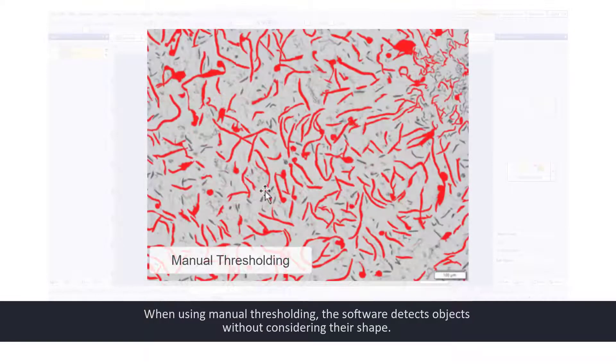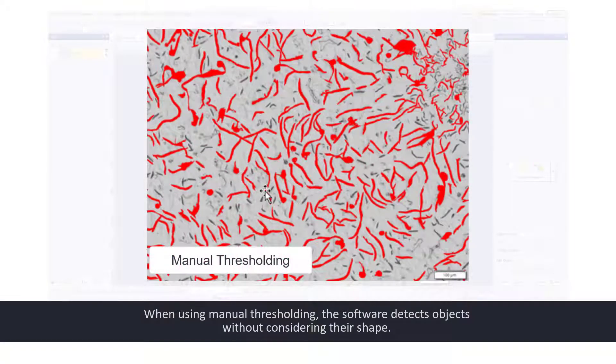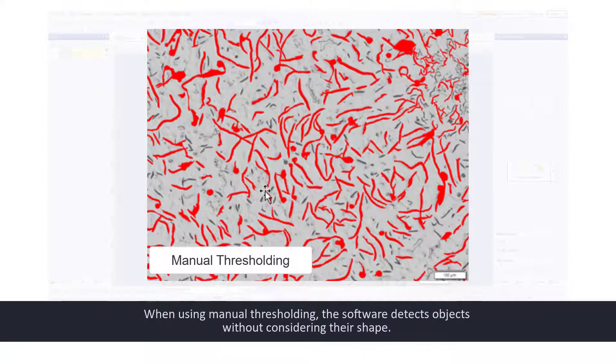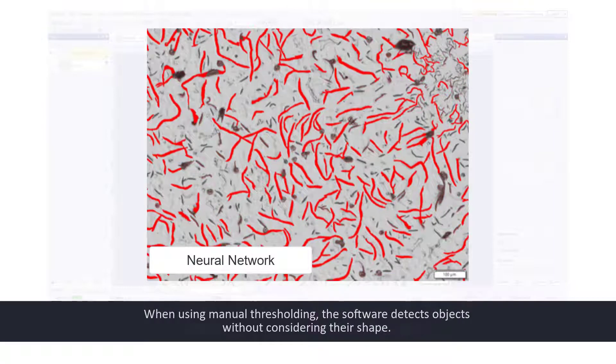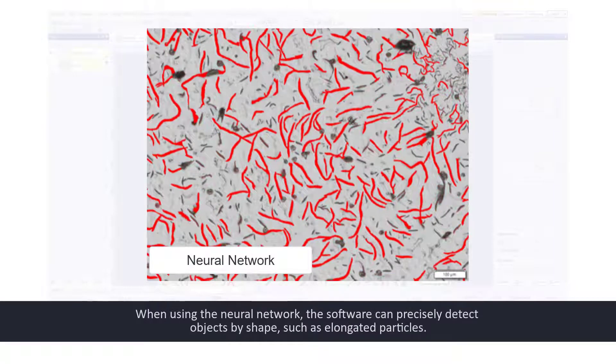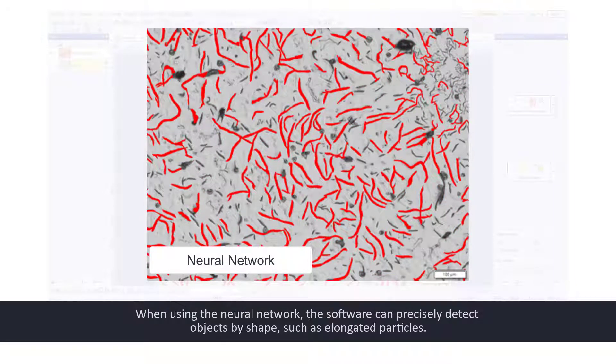When using manual thresholding, the software detects objects without considering their shape. When using the neural network, the software can precisely detect objects by shape, such as elongated particles.